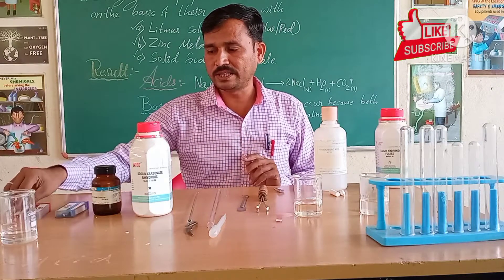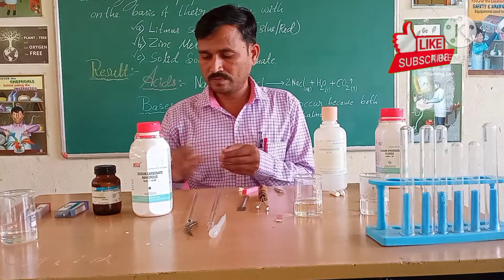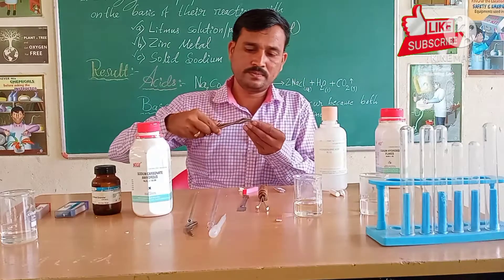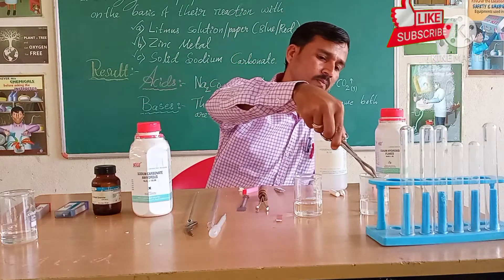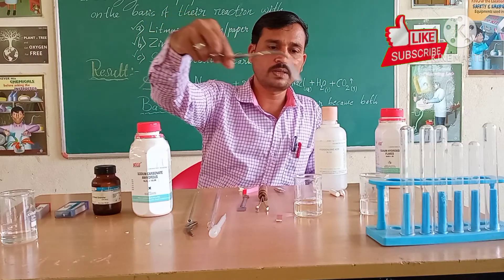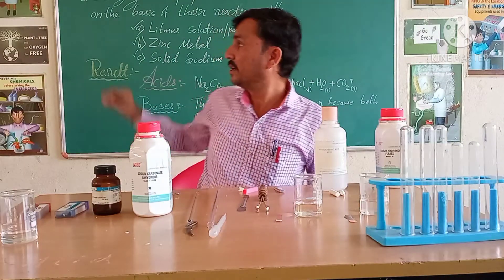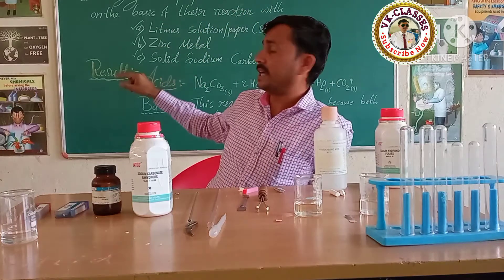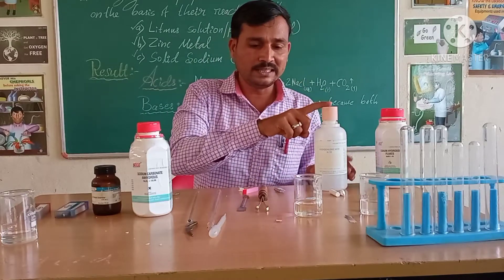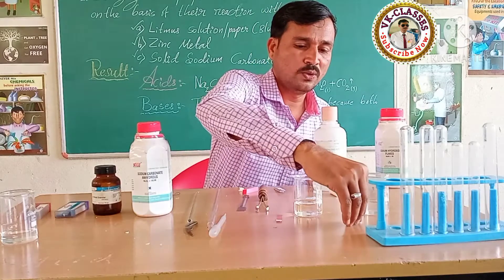Can you see the change of color? The blue litmus paper turns red. So, when a litmus paper is placed in acid, the acid changes the color of blue litmus to red. Now we will check the red litmus paper — dip it into the base. The red litmus paper turns blue.